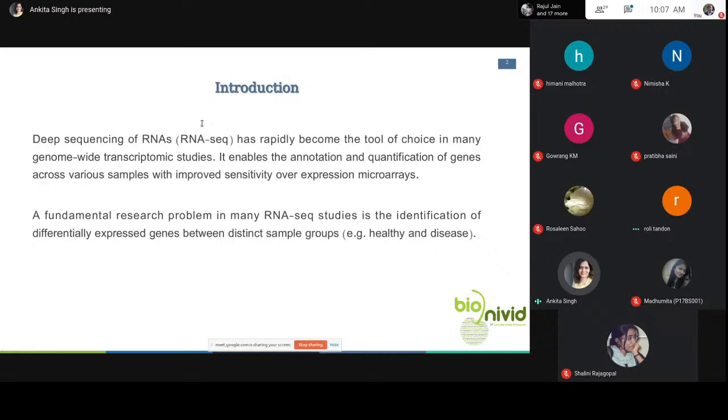So herein also you are studying how the expression pattern of the gene changes due to the introduction of some lotion on your body. Similarly, you have a condition wherein you compare a tumor and a healthy cell, wherein you want to compare what are the different genes which are going haywire in a disease or a cancer or a tumor condition.